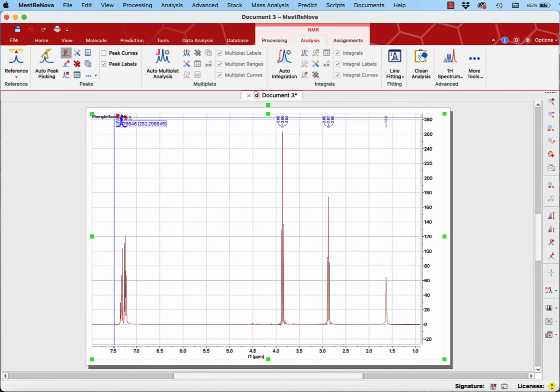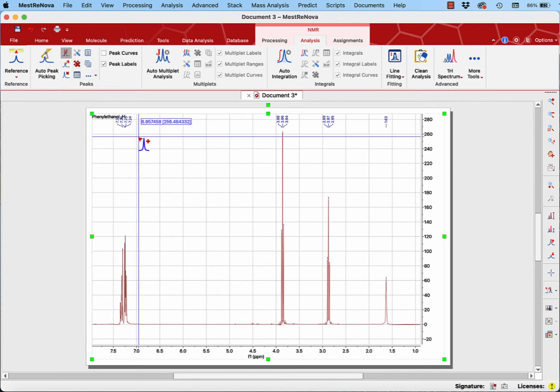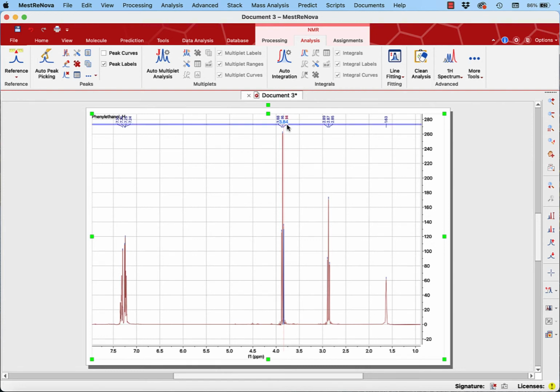Also notice that I've got this title up here. I actually don't know how to get rid of that, but if your peaks are obscured by the title, I do know how to work around it, and you can just lower the peaks. So let me get out of this mode. You see how I'm still in the peak picking mode. I get out, I get a normal cursor, and then if you hover over one of those peaks and it's highlighted in pink, you can do it anywhere, like over here. And then if you lower it, they're not covered up. Okay. So there are our frequencies labeled.